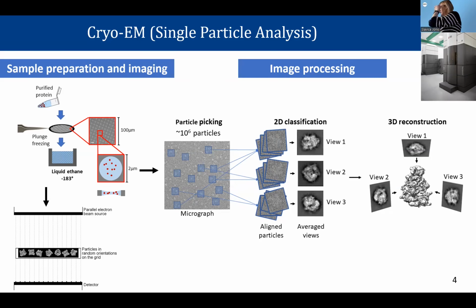This is not that important, and it is here just to say that all these different images will be, you can imagine, in different classes, and each class corresponds to a different view. So you have three angles to determine, three Euler angles to determine the view.